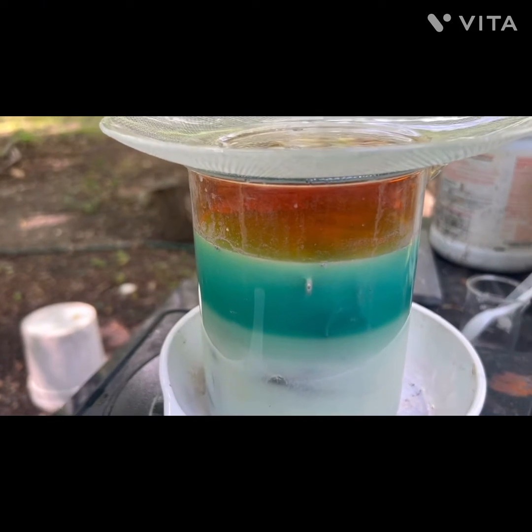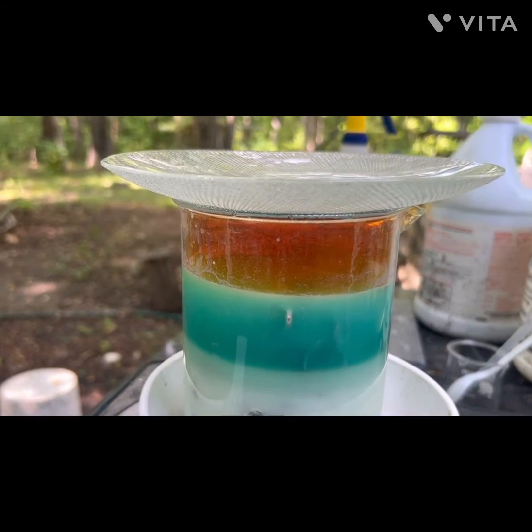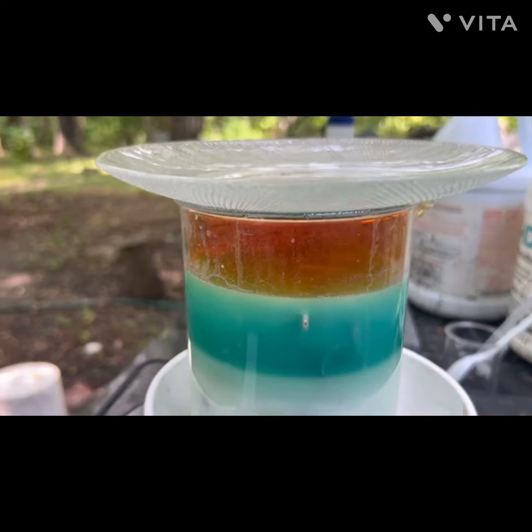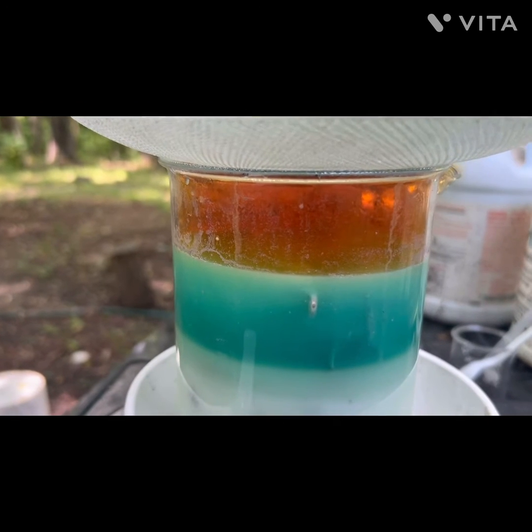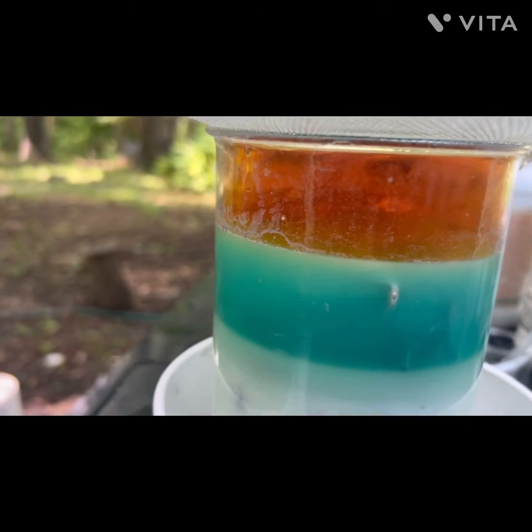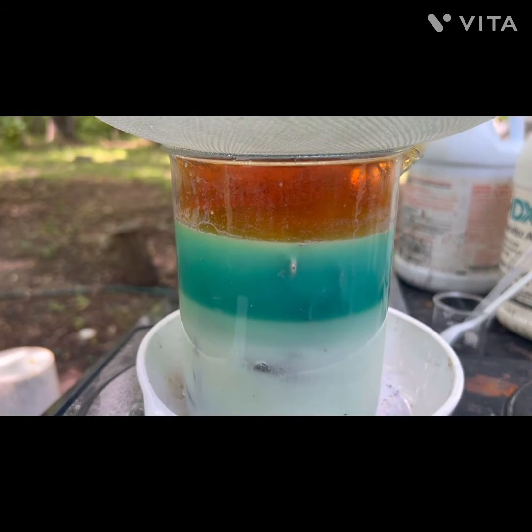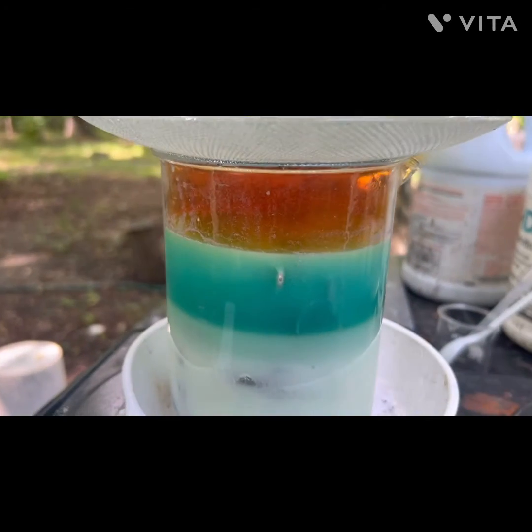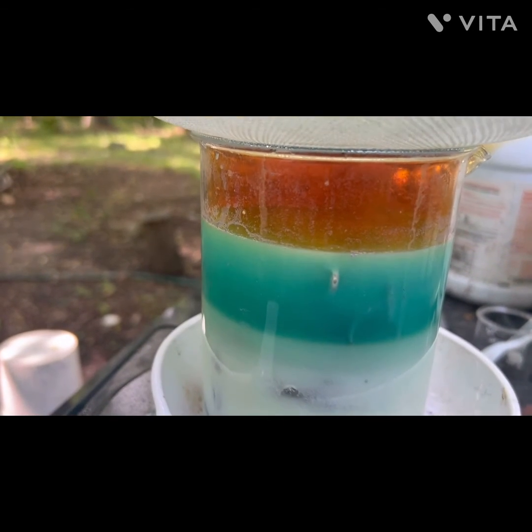We're stripping down the silver-plated plates but the spoons are still going at it. You can see we're starting to get a little nitrogen dioxide right there — that red — and we've got this white here which I believe is a little bit of silver sulfate and maybe some sodium nitrate crystals. There's no heat on it; this is all outdoor ambient temperature. We'll see if this stratification continues and settles out, but we're gonna leave it alone and probably come back tomorrow and check it out.